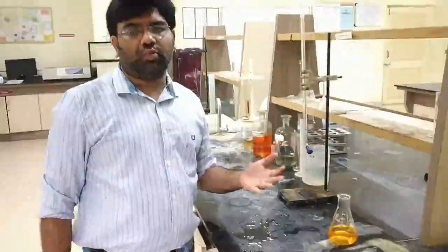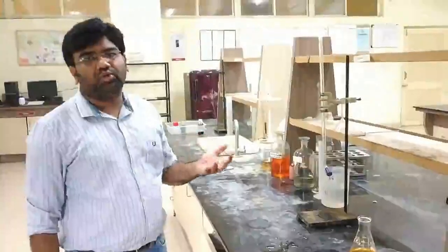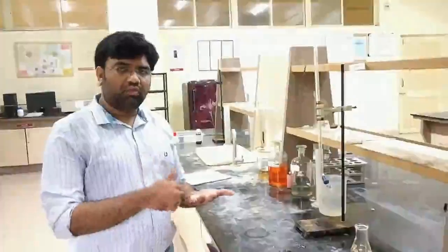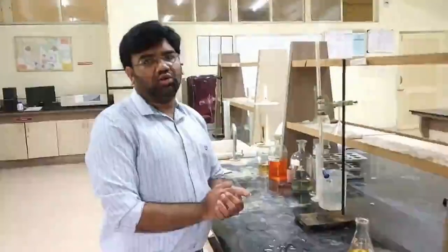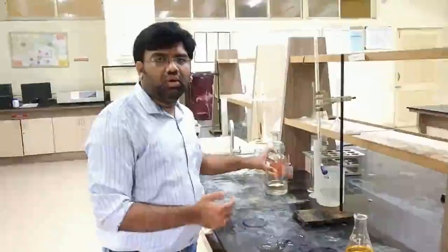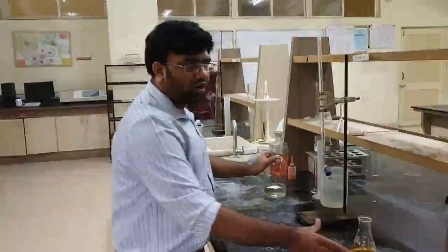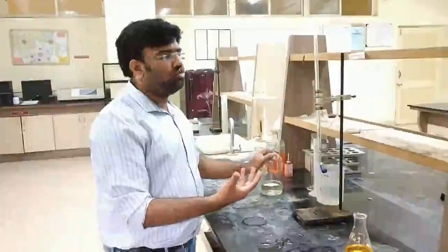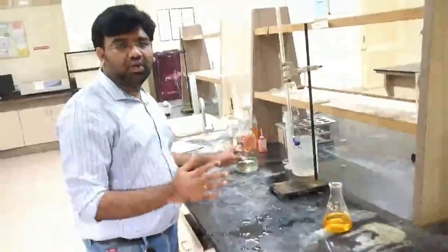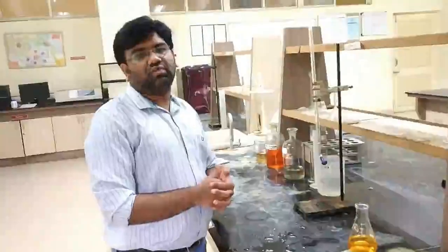This cooling is very, very important. If you don't do cooling properly, the amount of ferrous ammonium sulfate required will be very less, and because of that the normality that will be calculated and used further in the calculations will also be very less. So even though you have prepared good quality FAS of exact normality, because this liquid is hot, there are chances that you will get the wrong normality. Right, so we'll be waiting for 5 to 10 minutes, and after that we are going to start with the titration.